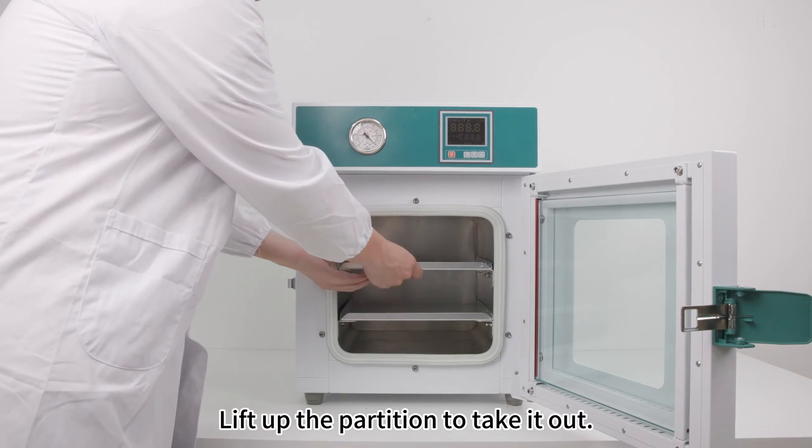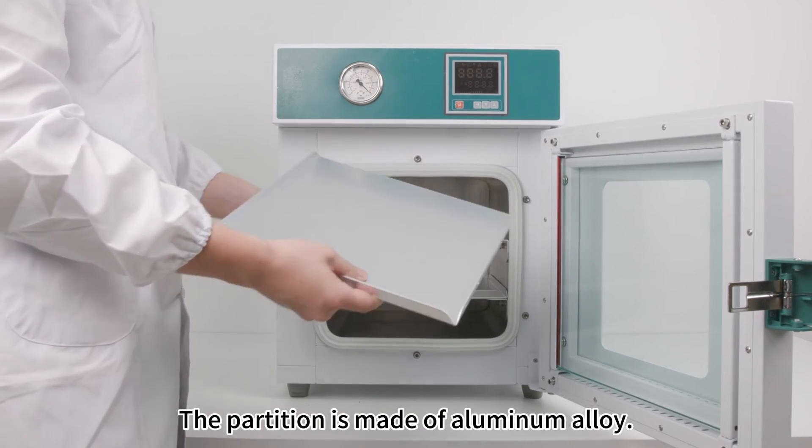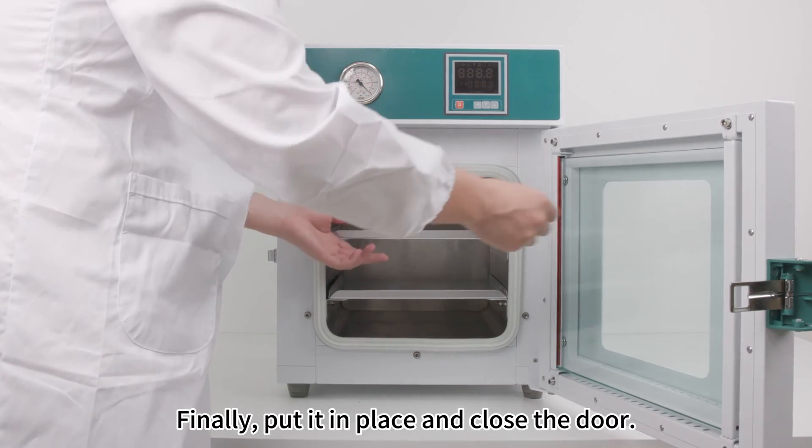Lift up the partition to take it out. The partition is made of aluminum alloy. Finally, put it in place and close the door.